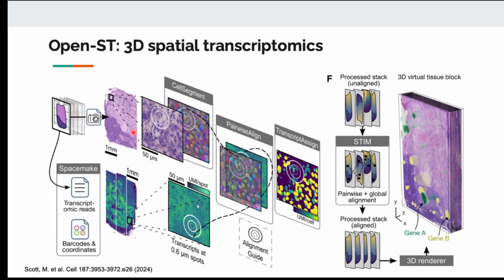And just to show you what we have today, we are moving toward 3D information. So we know that the tissue is not 2D, right? It's 3D. So nowadays, people are analyzing using imaging combined with hybridization and antibody to visualize the expression of gene and protein, and then put all the data together to see the 3D structure of the tissue. So this is like the new future.